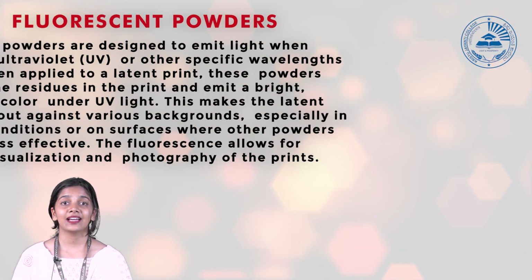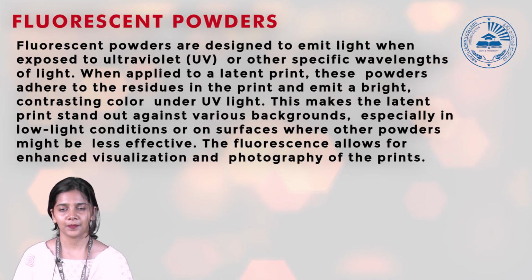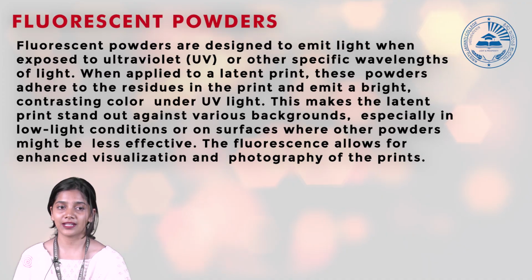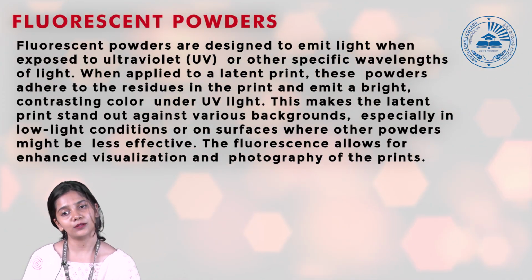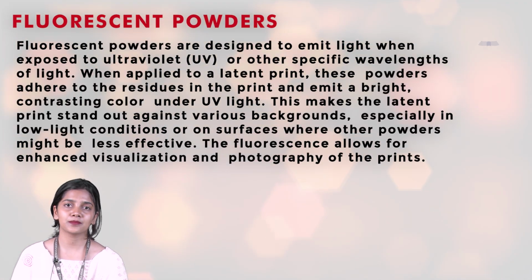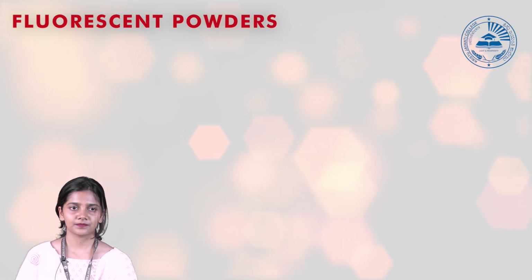Fluorescent powders are designed to emit light when exposed to ultraviolet radiation or other specific wavelengths of light. When applied to a latent print, these powders adhere to the residues in the print and emit a bright contrasting color under UV light. This makes the latent print stand out against various backgrounds, especially in low light conditions or on surfaces where other powders might be less effective. The fluorescence allows for enhanced visualization and photography of the prints.